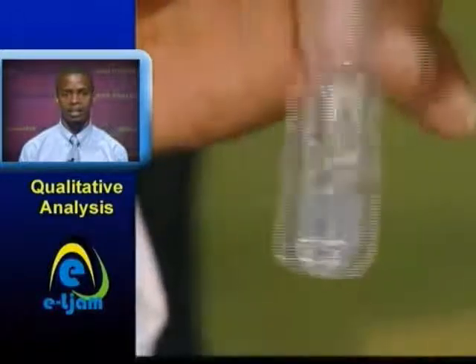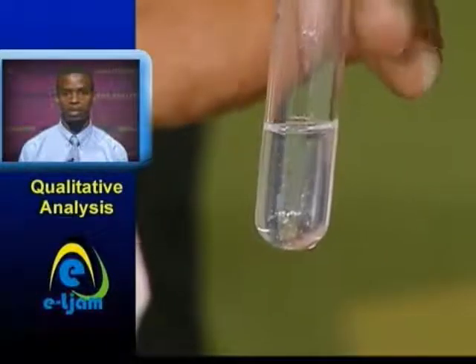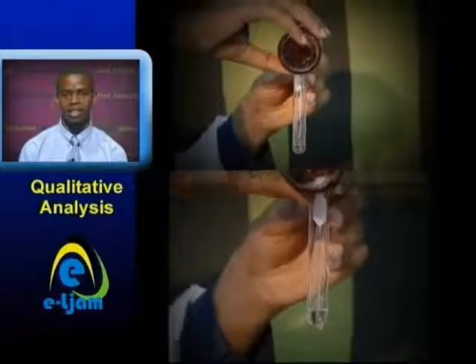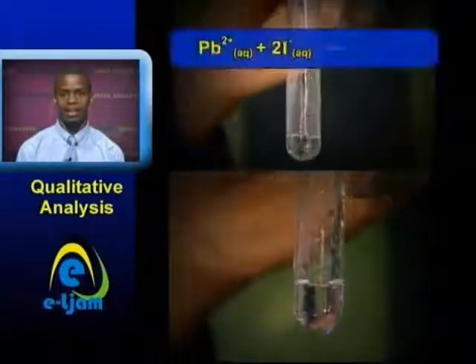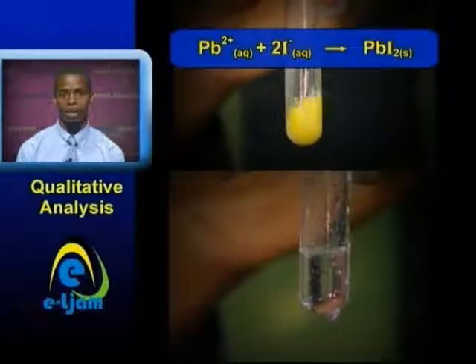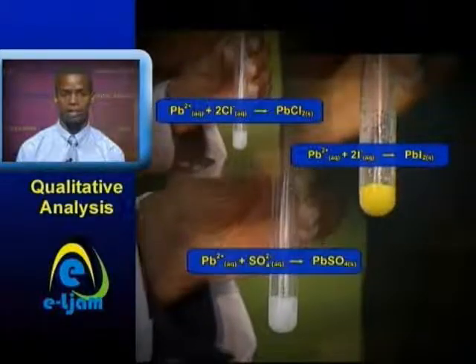The zinc ion is generally confirmed by the fact that its hydroxide is soluble in both excess aqueous ammonia and aqueous sodium hydroxide. To differentiate between aluminum 3+ and lead 2+ ions, solutions of iodide, chloride, or sulfate can be added. In all cases, lead 2 ions will form a precipitate while the aluminum ion will not. These precipitates are lead 2 chloride, white; lead iodide, yellow; and lead sulfate, white.